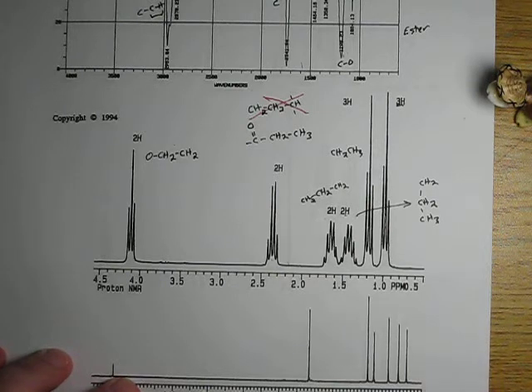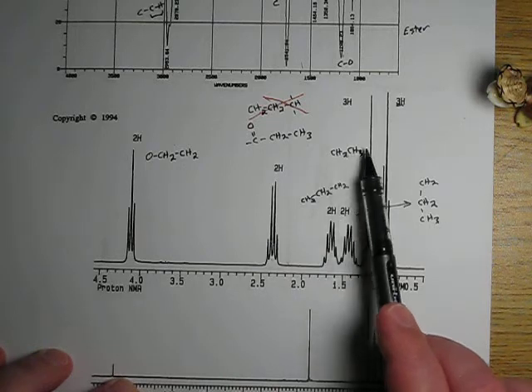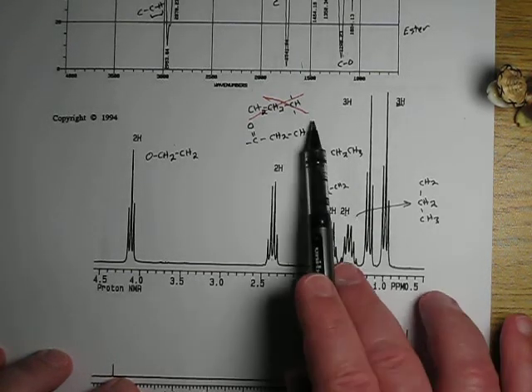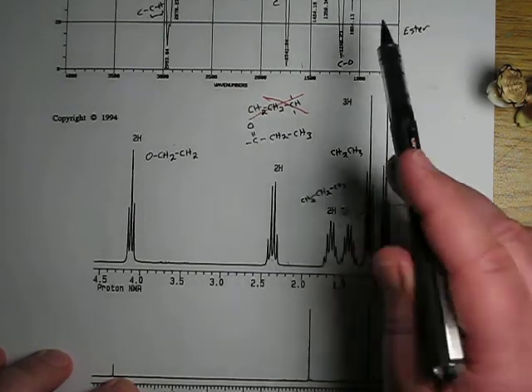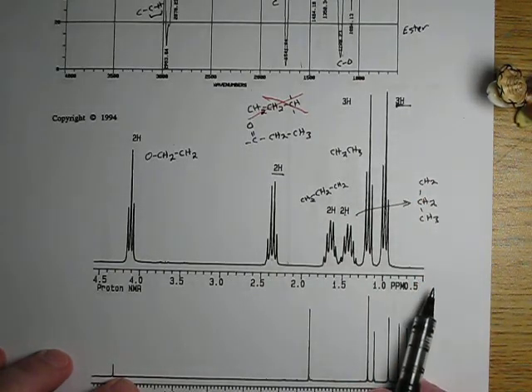Now, at this point, you were probably saying, what the heck? I'm looking at this and, oh my goodness gracious, I've got 1, 2, 3, 4, 5, 6, 7, 8, 9, 10. There's a lot of carbons in here and lots of hydrogens. Realize NMR gives us redundant information, so we have to figure out where the redundancies are. We're pretty confident of the carbonyl CH2, CH3 that this peak gave us. So that's this CH2 and one of these CH3s are taken care of.